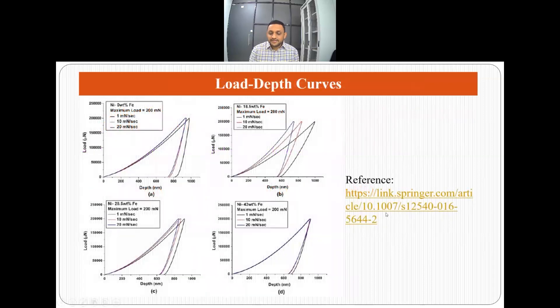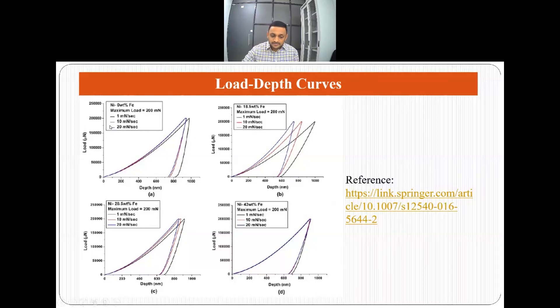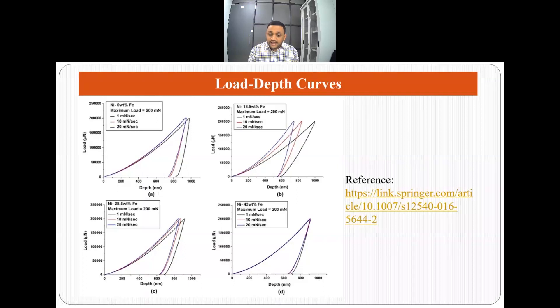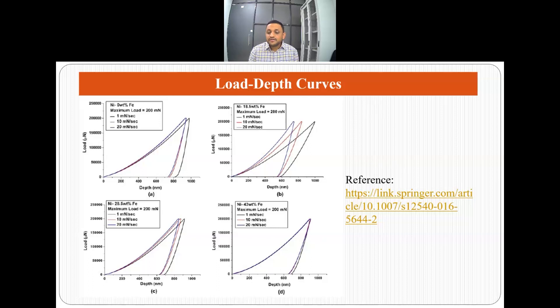The first result I obtained was the load-depth curves. Here you can see: this is load and this is depth. I could analyze the load-depth curves of different alloys — nickel 0 wt.% iron, nickel 18.5% iron, nickel 28.5% iron, and nickel 43.5 wt.% iron. You can use this approach for your own alloys and compare their load-depth curves to understand why you are getting the data from the nano-indentation experiment.